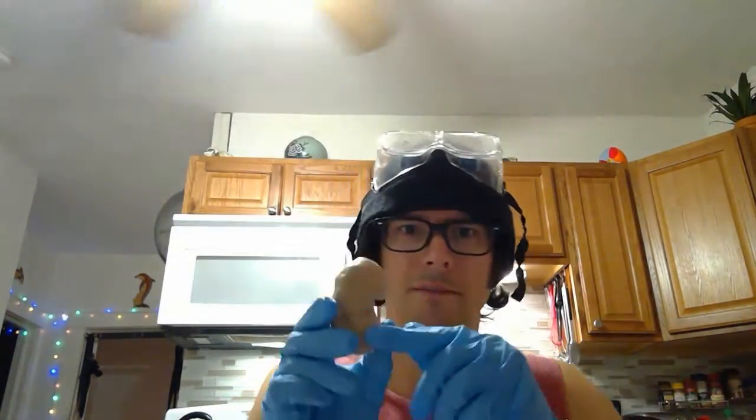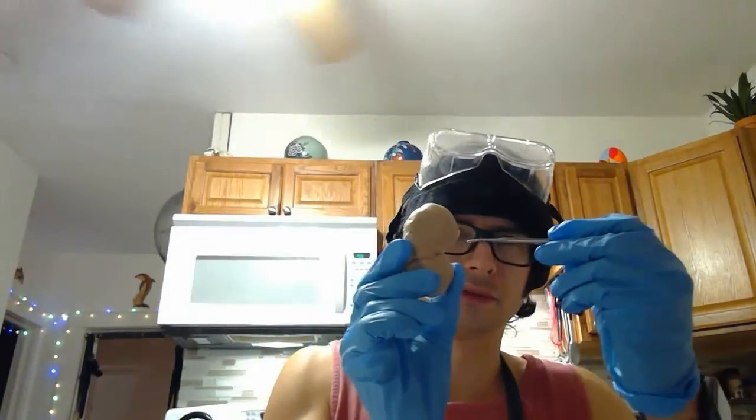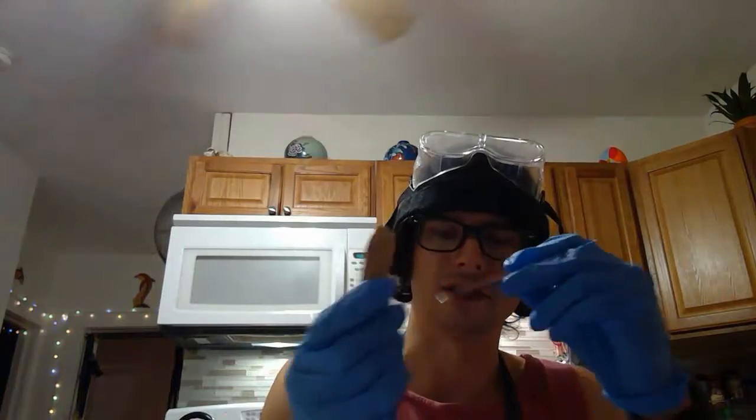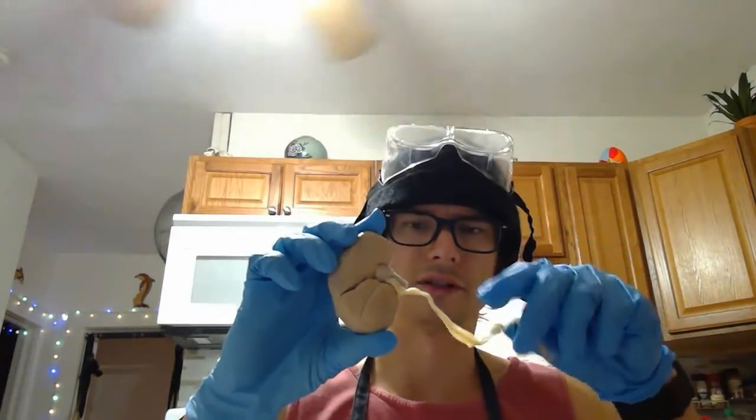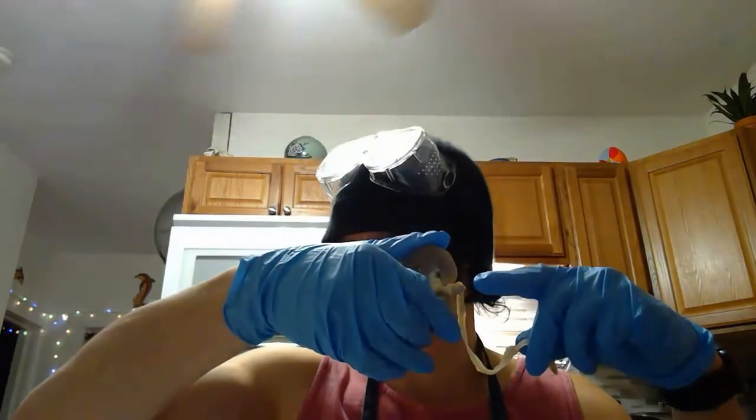On the outside would be the fibrous sheath, the renal capsule that goes over this kidney. I'm going to use this to point. So right here is the hilum. This is where the ureter meets with the renal pelvis, this large area right at the hilum, and up here is the renal sinus.